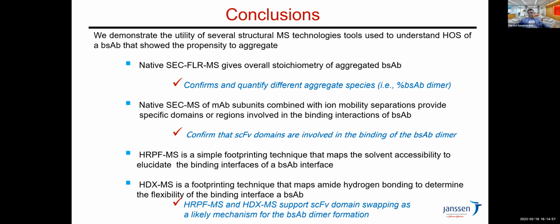We looked at its structure with native SEC-MS to obtain stoichiometry. And then we extended these studies, combining native SEC-MS with ion mobility, which is a gas phase separation. And then we did subunit analysis to take a step further to look at native conformations in the gas phase and narrow the binding regions to the scFv arms.